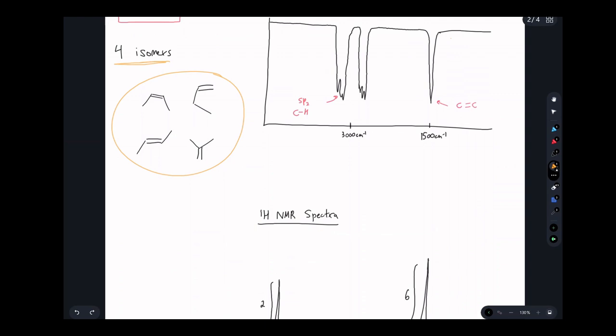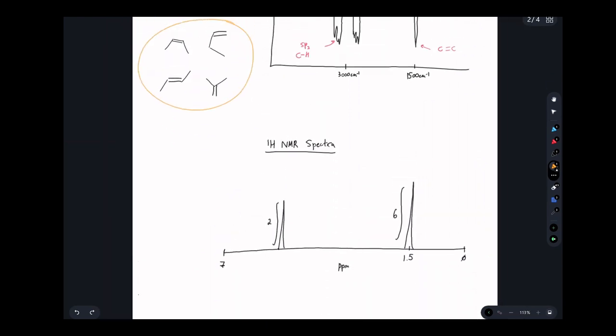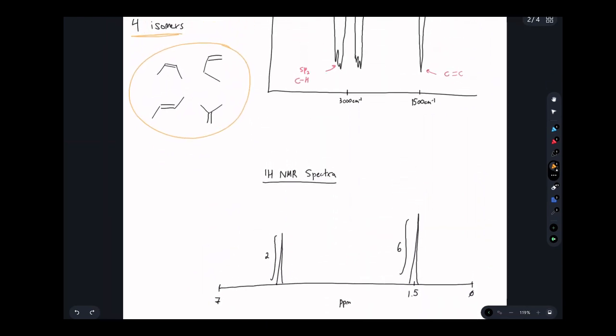So the 1H NMR spectra looks something like this. It's a little bit different, and we'll break it down in a lot more detail, so don't worry if you're confused looking at this right away. You'll notice that there isn't a y-axis, there's only an x one. And there are some weird peaks coming off of that x-axis.